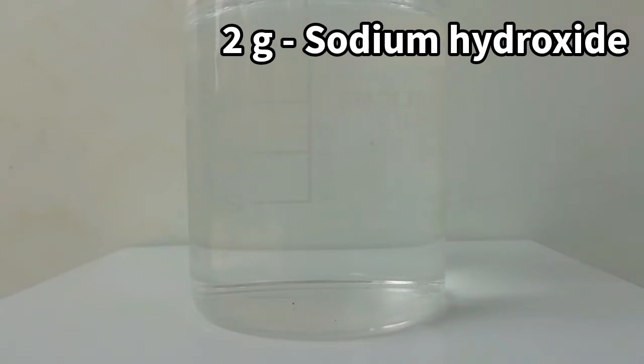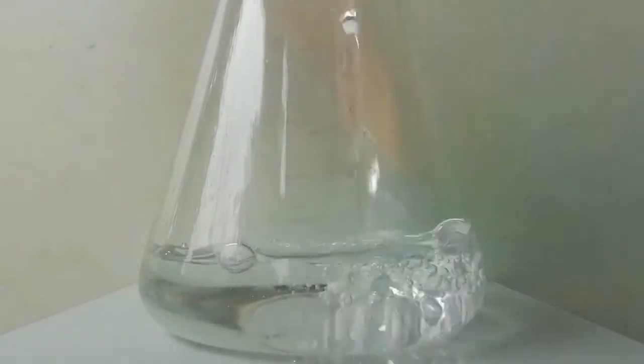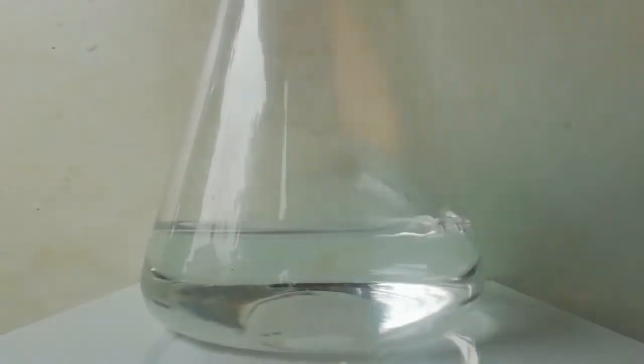First, 2 grams of sodium hydroxide is dissolved in 100 milliliters of distilled water and added to a 250 milliliter conical flask.